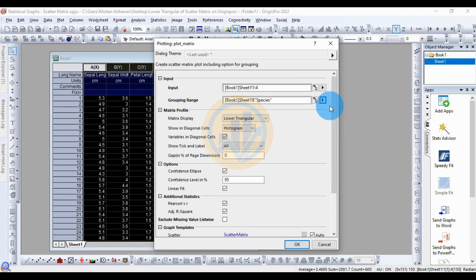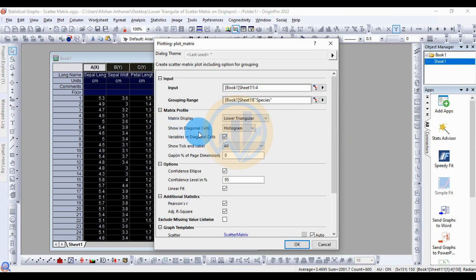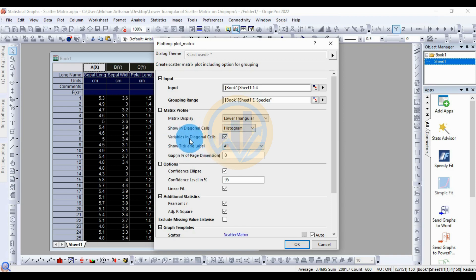For the matrix display, you can select lower triangle, upper triangle, or square. Select the lower triangle. For the diagonal cells, choose to show a histogram. There is a visible checkbox for the diagonal cells — make sure it is selected.